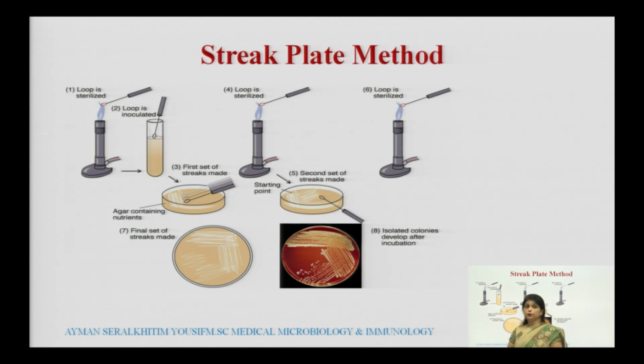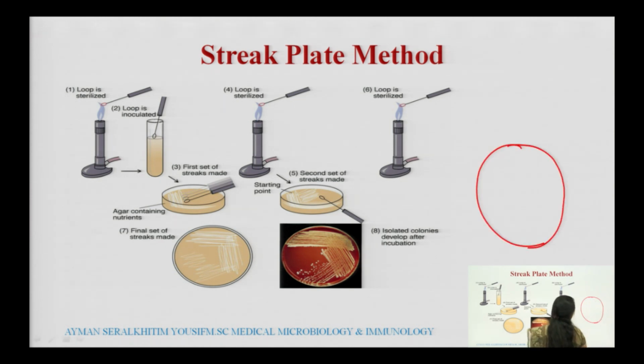So, first we need to make sterile Petri plates containing agar medium that must be solid in nature. When we keep that Petri plate at room temperature, that media will get solidified. In this way, when we try to isolate, we have to take the mixed culture. First, we must have a Petri plate containing solid media. Second, we must have the culture from which we need to isolate the pure samples or pure species.